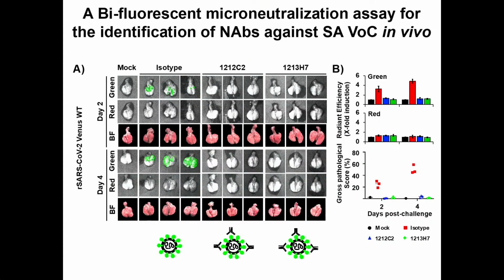I just want to show you here the results that we obtained in the case of mice that were infected with the Washington strain virus that expresses Venus.